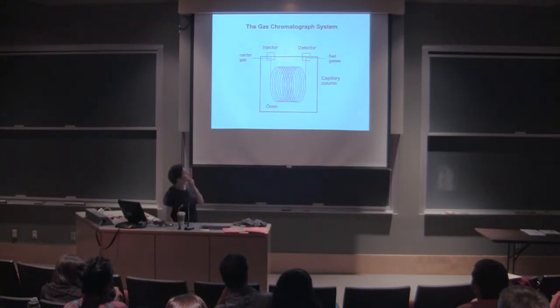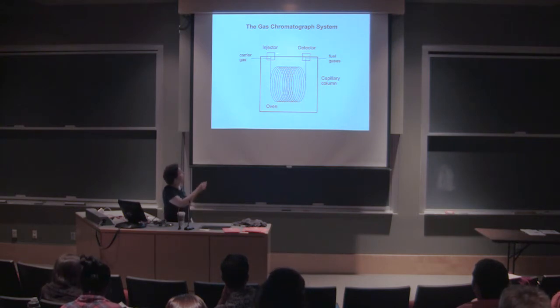Okay. So continuing our journey under the hood here, this is a diagram of a gas chromatograph.